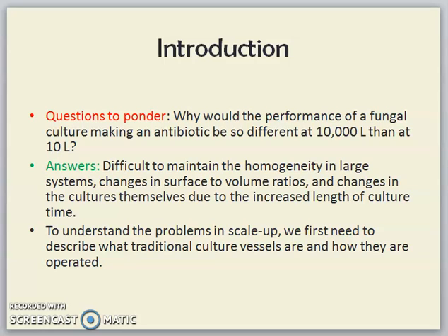The answer is, it is difficult to maintain the homogeneity in large systems, changes in surface to volume ratios, and changes in cultures themselves due to the increased length of culture time. And we need to understand the problem in scale up, in which we need to describe what traditional culture vessels are being used and how they are being operated.